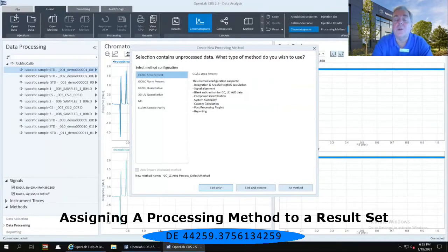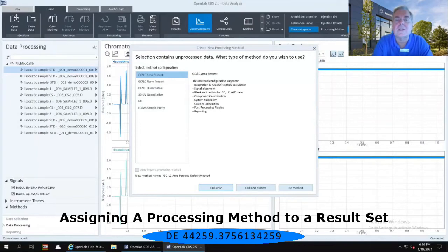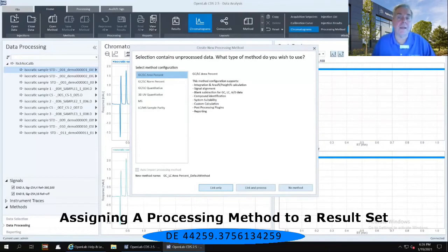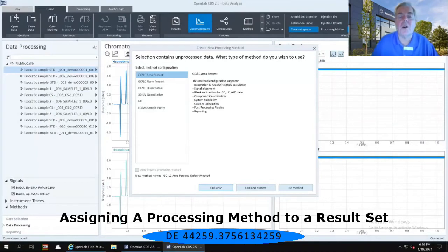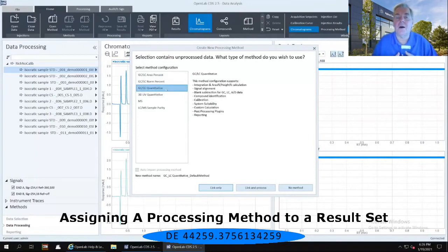If I would like to create a calibration curve so I can quantitate against a calibrated curve, then I cannot use a GC/LC area percent because area percent won't make available the calibration section of that method. So instead, I am going to call for the GC/LC quantitative method.